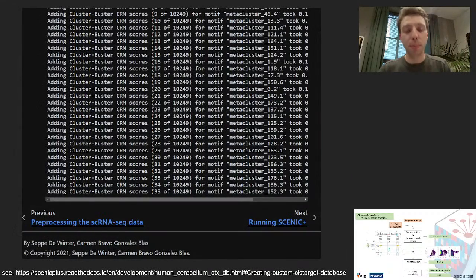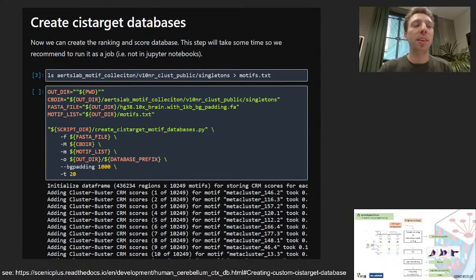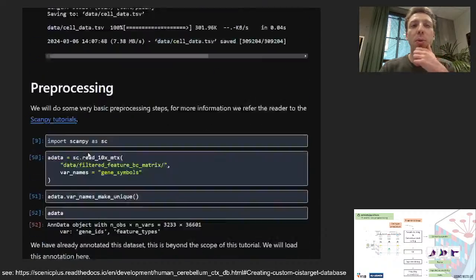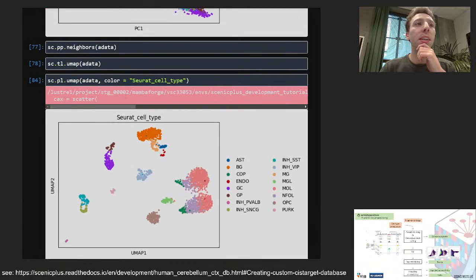Yes, over here. So again, I won't recalculate the QC right now because it will take some time, but I'll show you on the tutorial. There we can also see the QC stats.